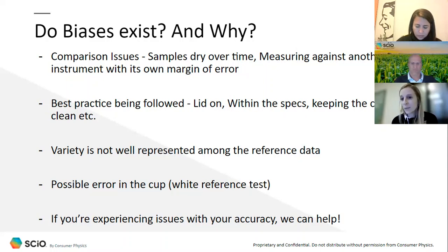Other reasons is that best practice is not being followed. We have Dana, who does some fantastic training, and Jared, they do great training on best practice when measuring with your cup. I highly recommend attending one of those sessions because it's really about maximizing and optimizing your cup to get the best accuracy. And even though it's a very simple product to use, there's a lot of things that can influence your results.